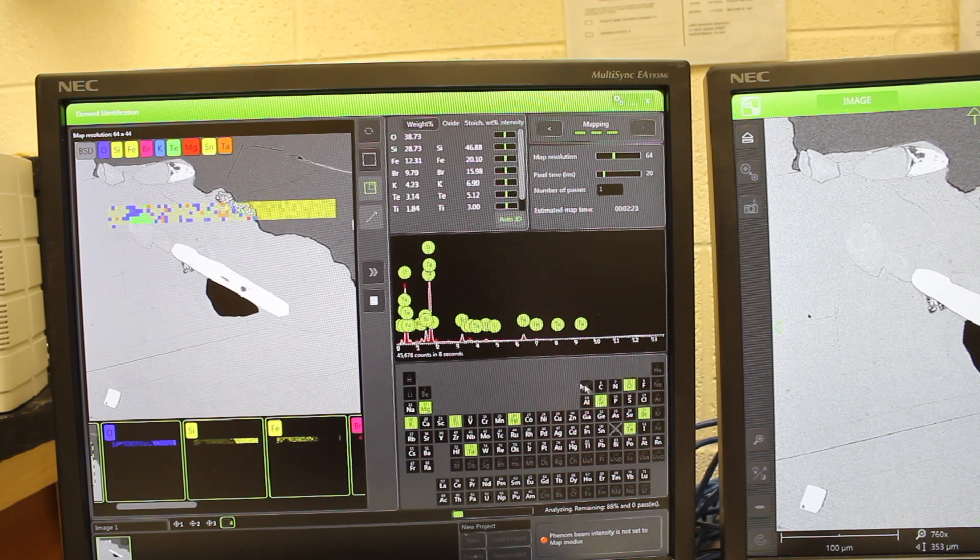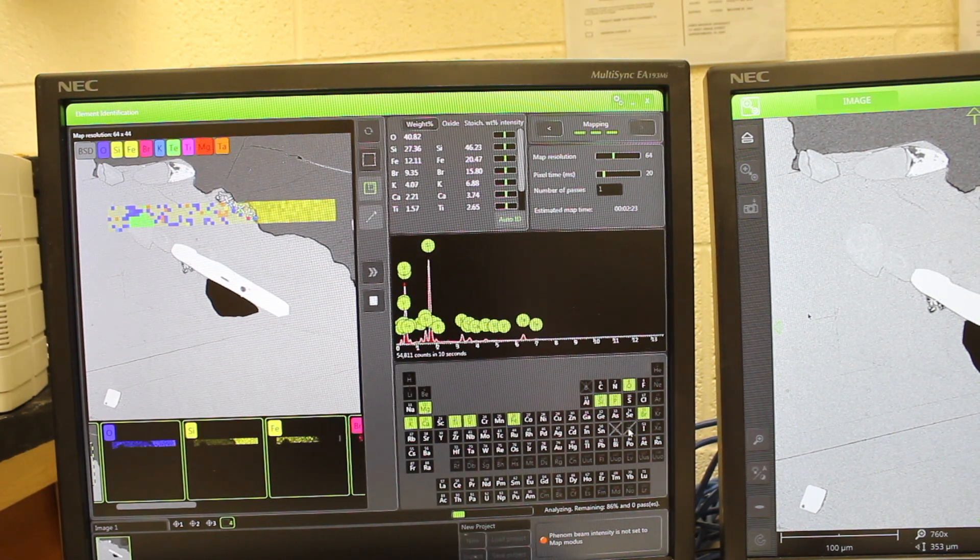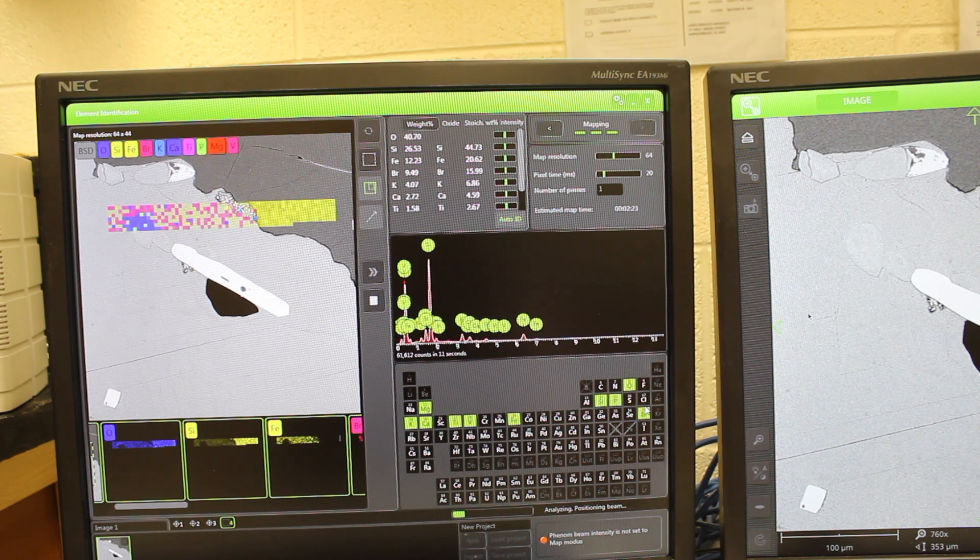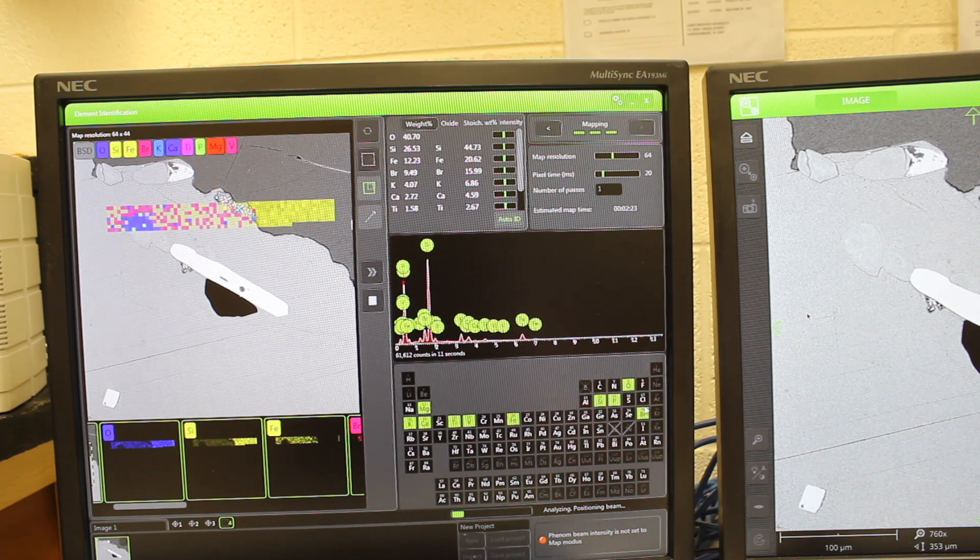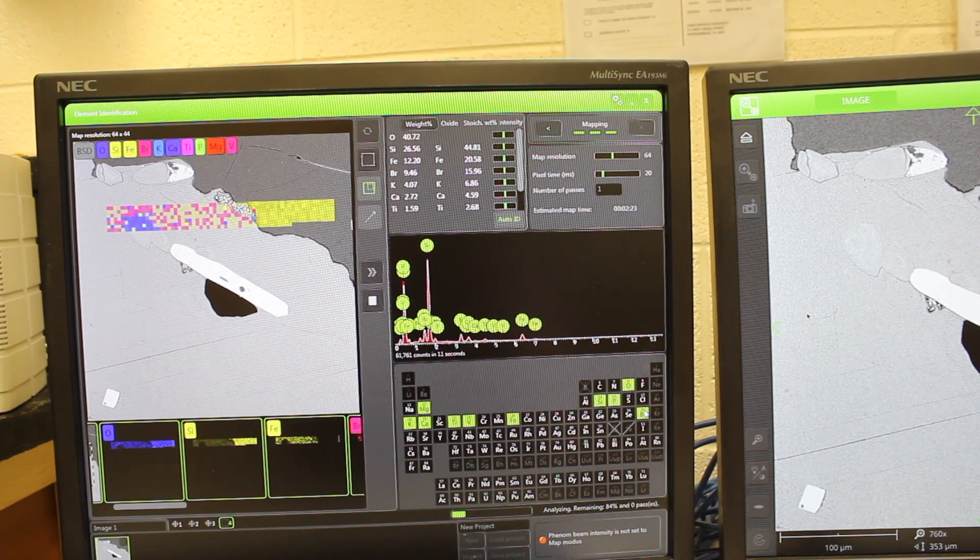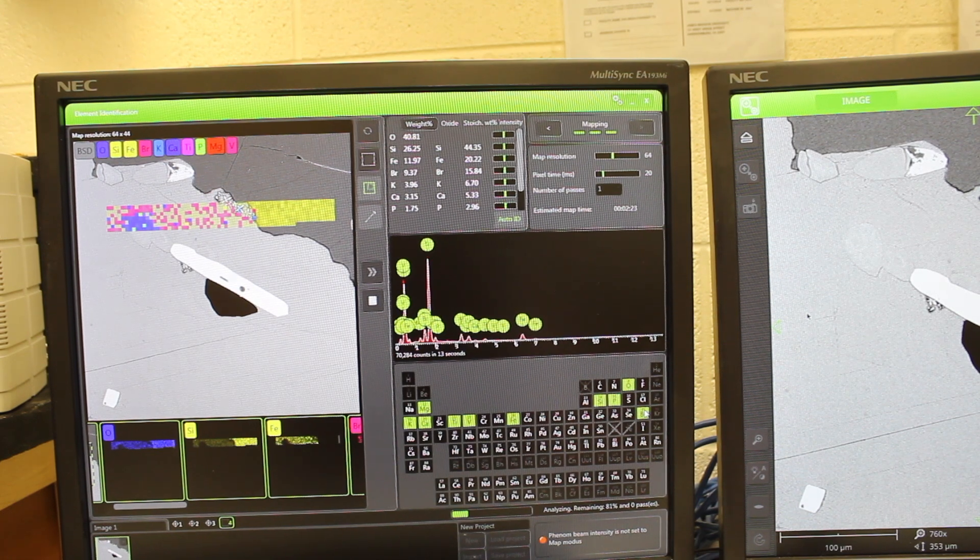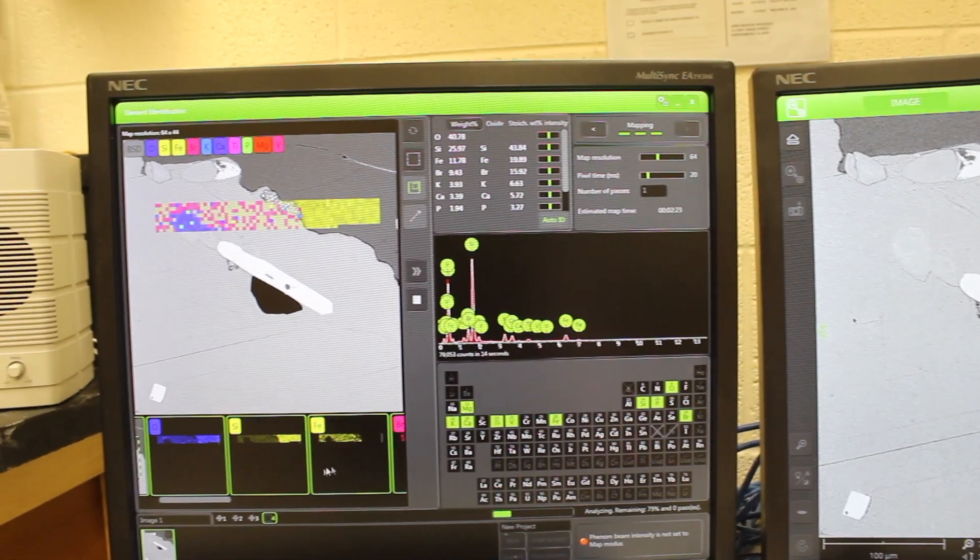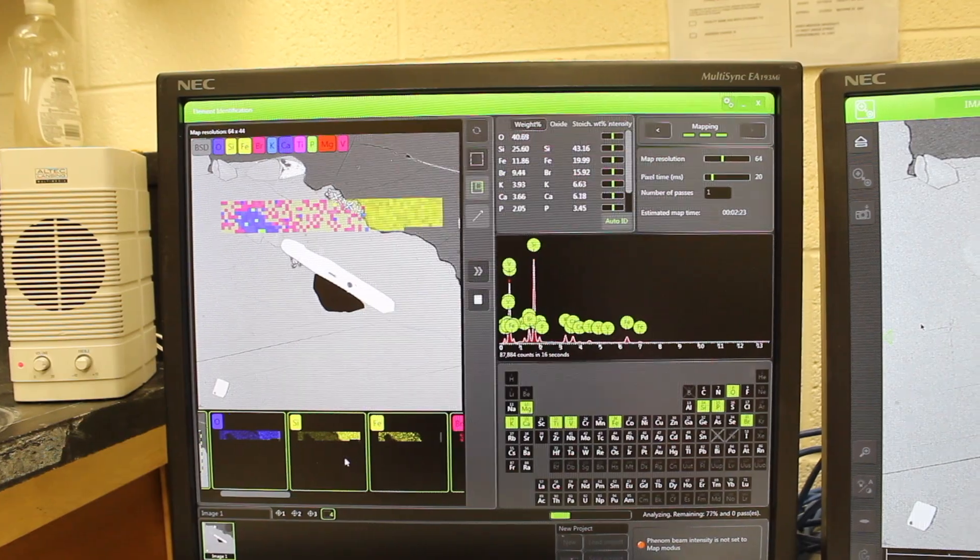Just like the point analyses, say I don't want tellurium, I'm not so sure about bromine being there, and so you can choose which elements you want to map, and the maps are shown down here at the bottom.